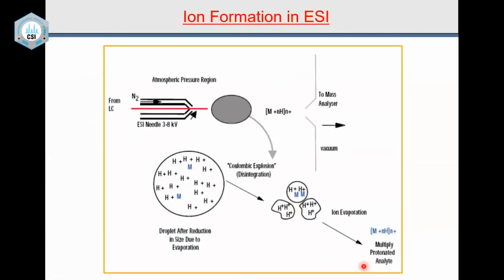Again, which is the same thing as you see here, and sometimes when you are using biomolecules, you have to remember, if you are using normal small molecules, that puts one charge on the molecule, so you get M+. Here it is not M+, I will explain to you what is actually formed. And then, if you are using biomolecules, it will put multiple charges. That will also be explained. So what is a single charged ion and what is a multiple charged ion?